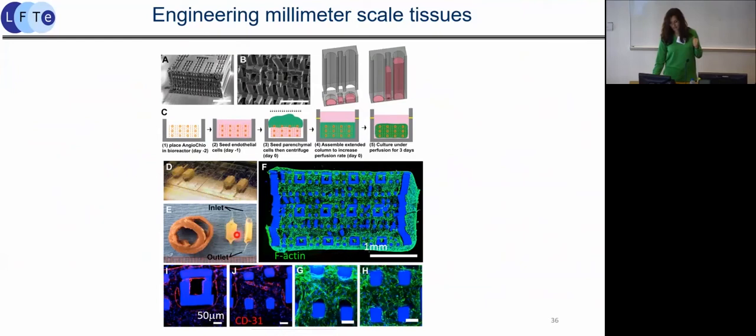And if you look at the cross-section, this is about as thick as the heart wall of a rat. And you can see that the cells are present all throughout. What he also did is he added some endothelial cells in the parenchymal space, so you got sprouting and cell interaction from these prefabricated lumens and those that were actually self-assembling in the parenchyma.